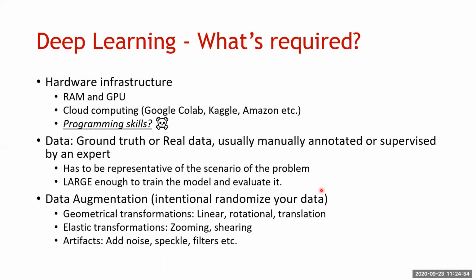Programming skills, well, you don't need them in this case, because I'm going to show you how you get around that. But obviously, it doesn't hurt. Not everyone has the option of going out there and learning a language from scratch. But especially when things go wrong, even if the code is hidden, it helps to be able to leverage some knowledge on why something went wrong, or how you would play with or augment somebody else's open source code to make it more suitable to your experiment.